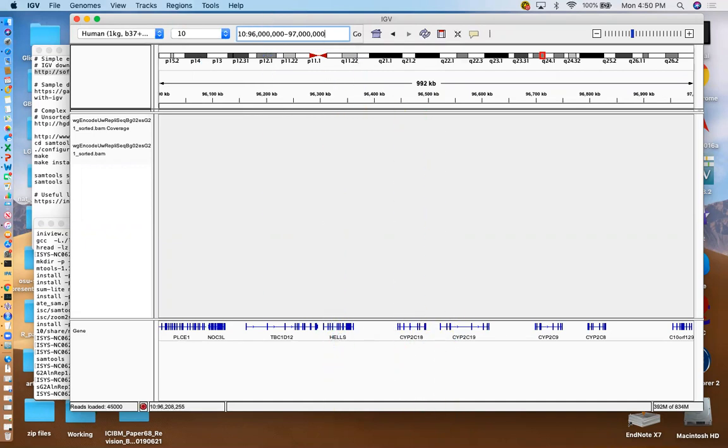And if you look at the bottom left-hand corner, you can see the reads being loaded into IGV from our sorted and indexed BAM file. So bear with me for a few seconds while it loads these, and I'll show you the reads being aligned after it's all loaded.